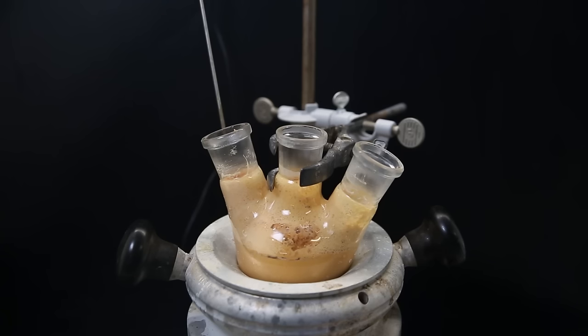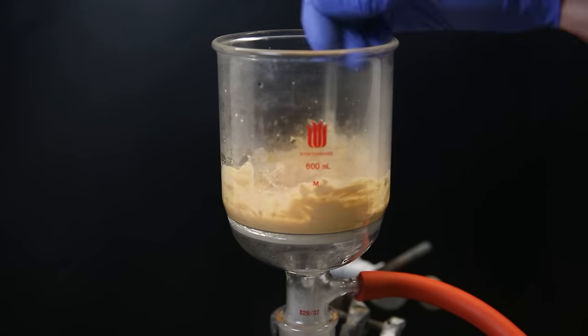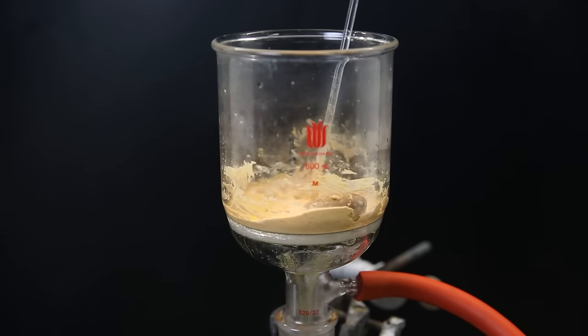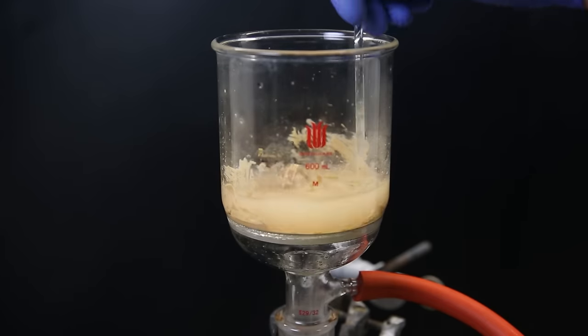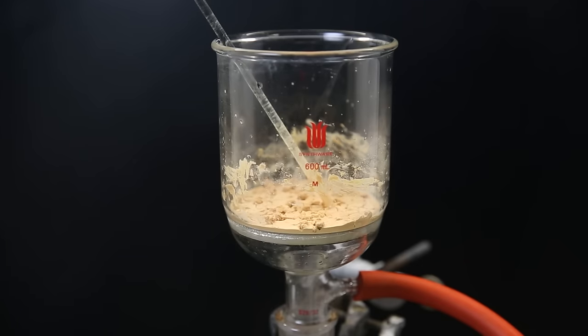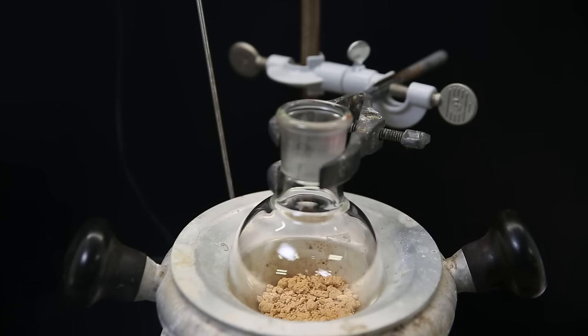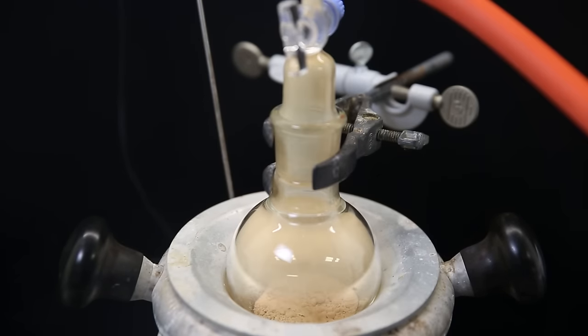I remove all of the adapters, and then, to collect all of the solid, I filter all of it under a vacuum, through a glass filter with a paper filter on top. I then remove impurities and unreacted reagents by washing it with a 4-molar hydrochloric acid solution, and then twice with some diethyl ether. Now the solid still contains water and ether, so I moved it all to a flask, started heating it, and then pulled a strong vacuum. When that was done, it became a dry, light yellow powder.